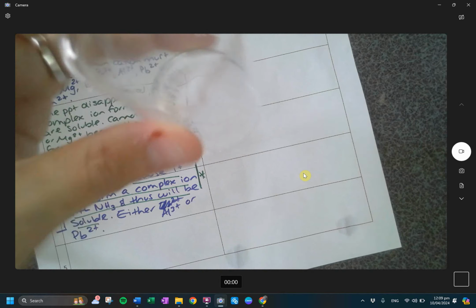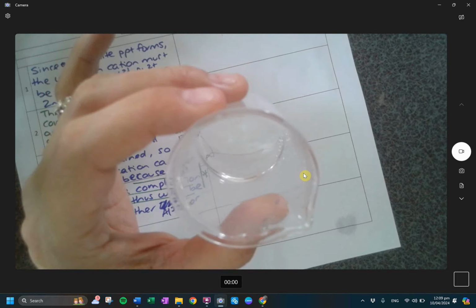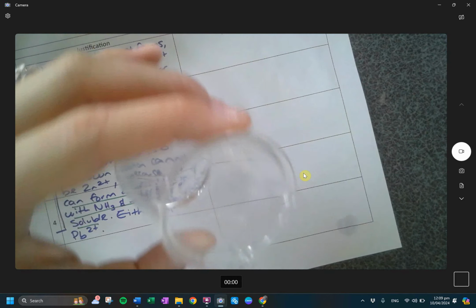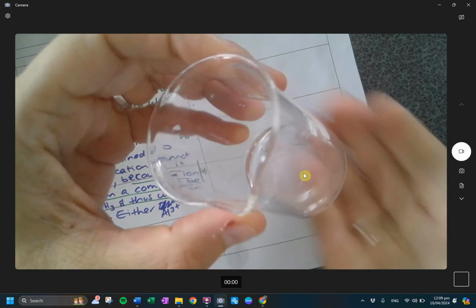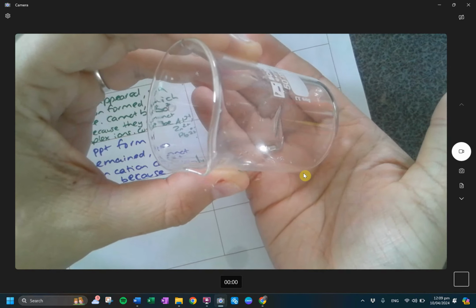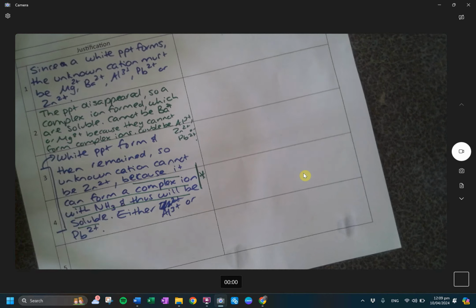So that's going there. And then now I gotta find my sulfuric acid, which is over here. We add 2 drops, just a few drops actually. Look at it, not forming anything. If I want as a reference point to see what lead would look like, I can grab another beaker. Just gonna get a mess of beakers right now. It's gonna be fun to clean up.